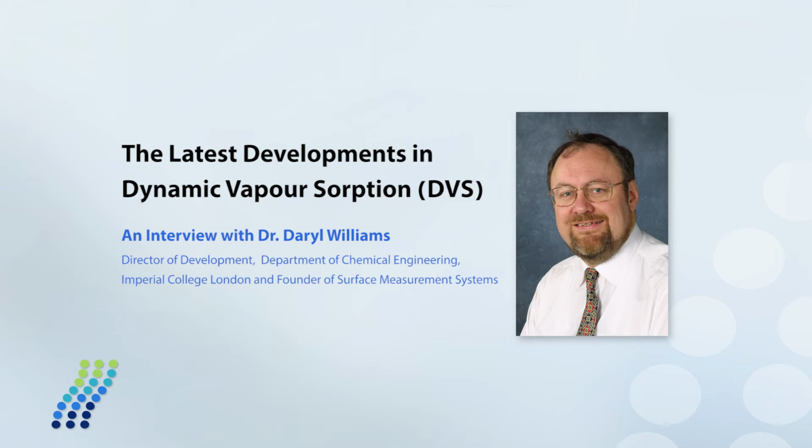If we look in the modern analytical laboratory, we will find very few, indeed probably no instruments that look at the way a material behaves as a function of humidity or the relative humidity in the air. So DVS in many ways has a unique role in the laboratory.